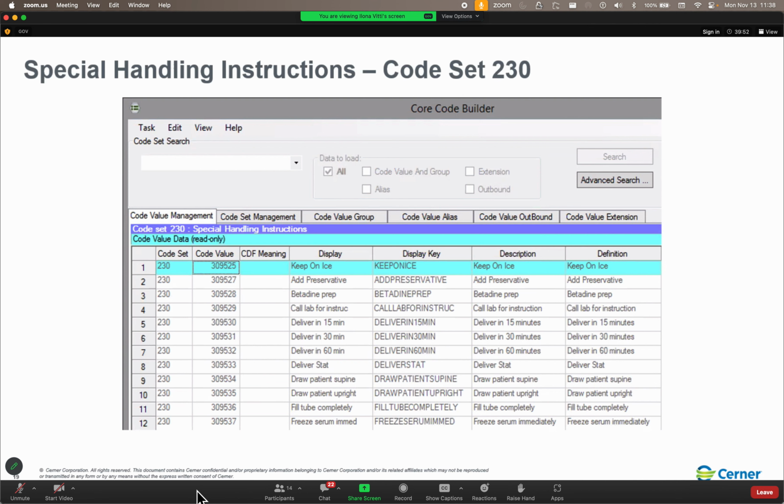So I am a big fan of this because this lets me copy the build that I already know works out to my new orders, and I could set up the routing for a dozen orders all in one shot by simply moving them, clicking on copy, moving them from the left to the right, clicking OK, bam. All of them have their collection requirements now.